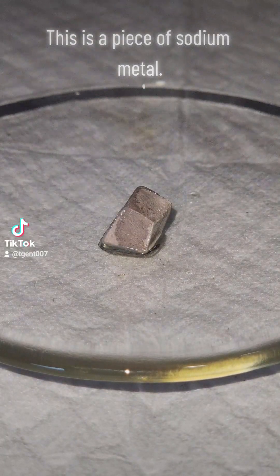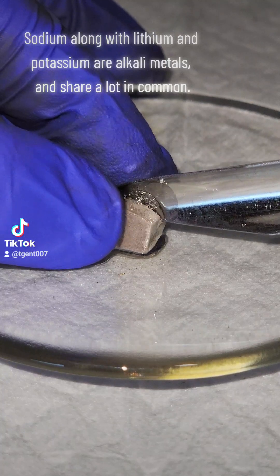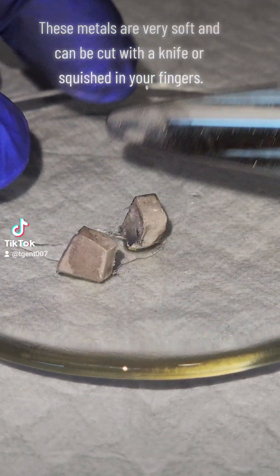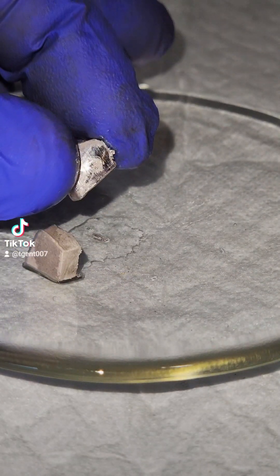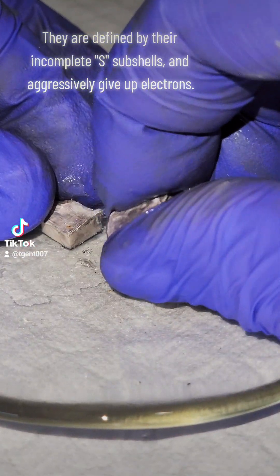This is a piece of sodium metal. Sodium, along with lithium and potassium, are alkali metals and share a lot in common. These metals are very soft and can be cut with a knife or squished in your fingers. They are defined by their incomplete S subshells and aggressively give up electrons.